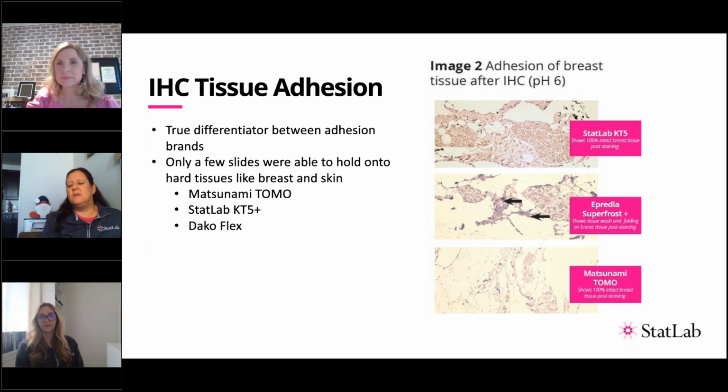If I were to pull this off of the stainer, honestly, I would have been a little bit upset because that means that I need to spend more time, probably to recut that slide or pull an unstained slide and run that stain again. I know if I hand that to my pathologist, he's probably going to say, what happened to the rest of this tissue? What if there's an area of concern in one of the areas that kind of washed off? And so another stain is probably going to need to be rerun just to get the best diagnosis possible. Thanks, Rachel.